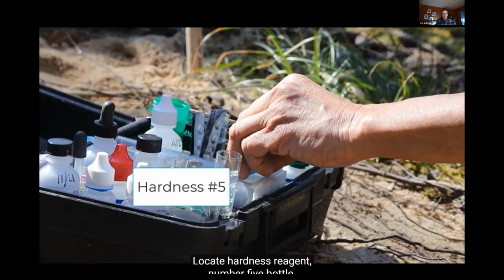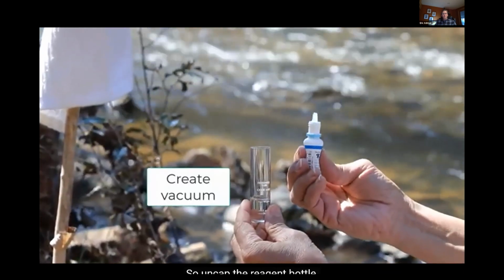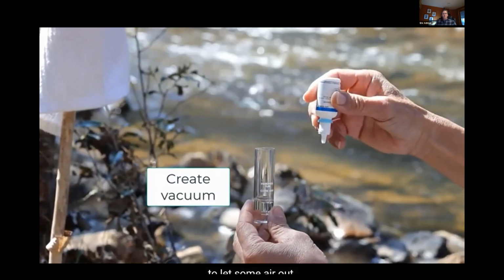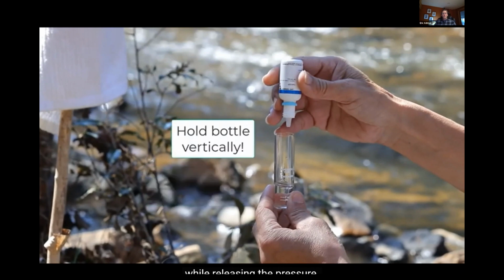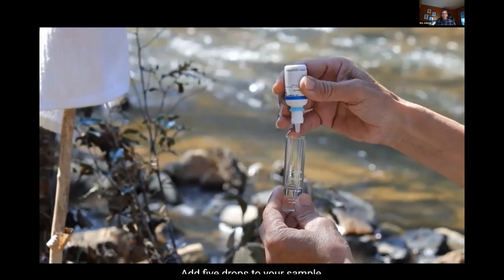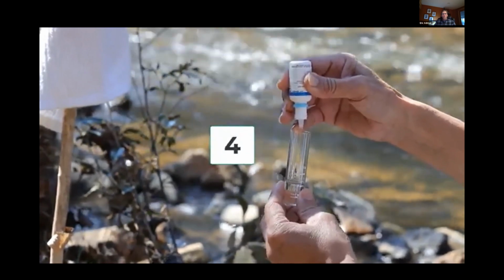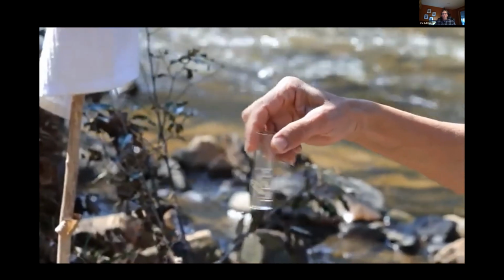Locate hardness reagent number 5 bottle. This bottle has a built-in dropper, so uncap the reagent bottle. Gently squeeze it in the upright position to let some air out, and then turn the bottle upside down while releasing the pressure. When dispensing the reagent, take care to hold the bottle vertically. This ensures uniform size drops. Add 5 drops to your sample and gently swirl to mix.